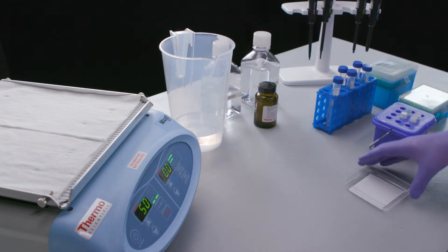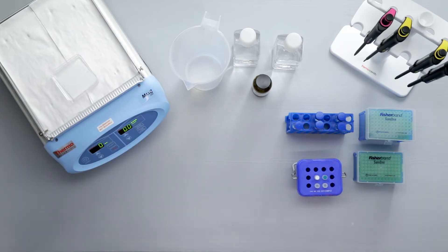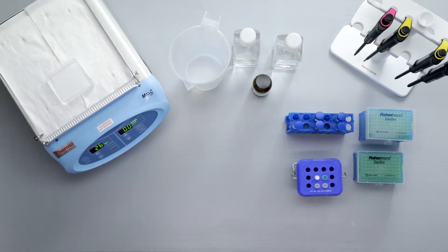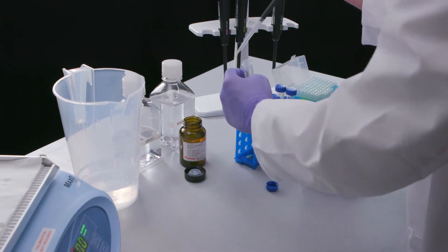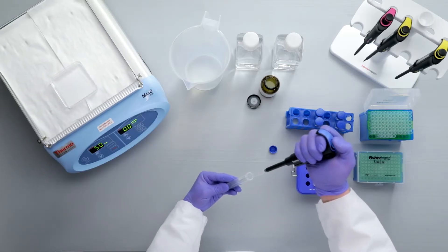After protein transfer, wash the membrane in deionized water with agitation to remove excess transfer buffer. Prepare the blocking buffer by diluting the Blocker FL fluorescent blocking buffer from 10x to 1x with deionized water.